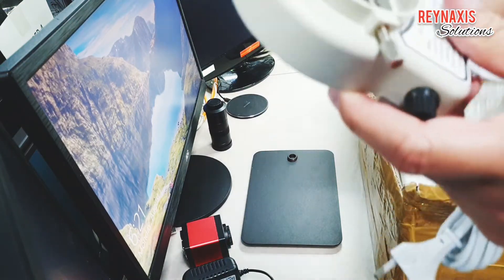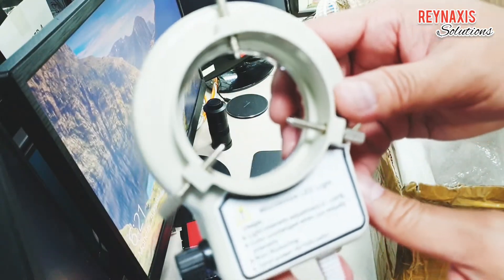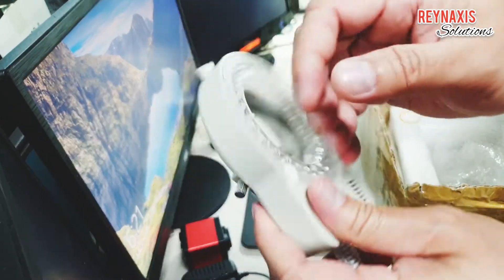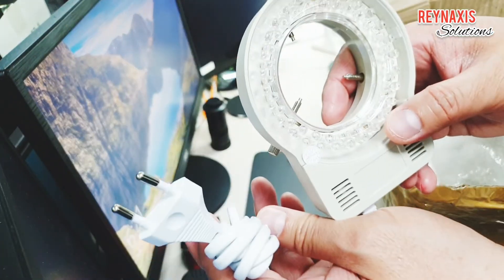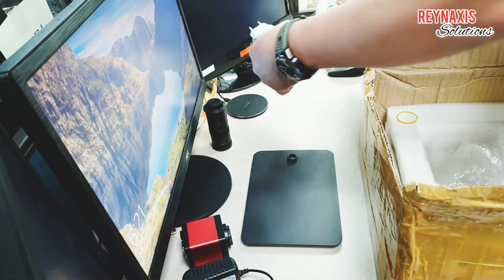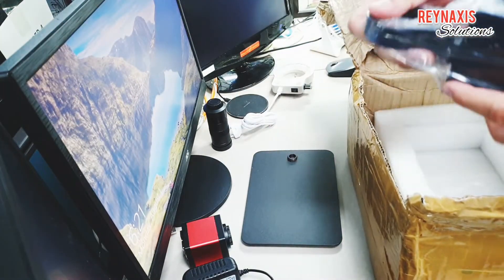It also comes with an array of LED lights to illuminate the subject you're looking at, and this thing is powered by 220 volts. The plug is 2-pin, so you will have to use a 3-pin adapter for that.